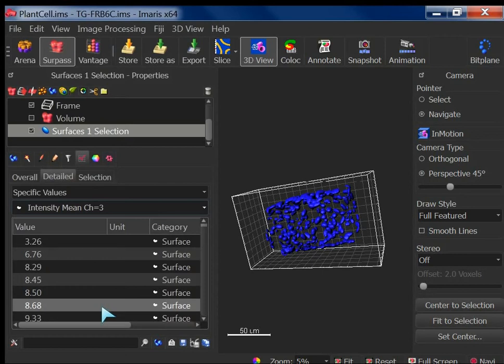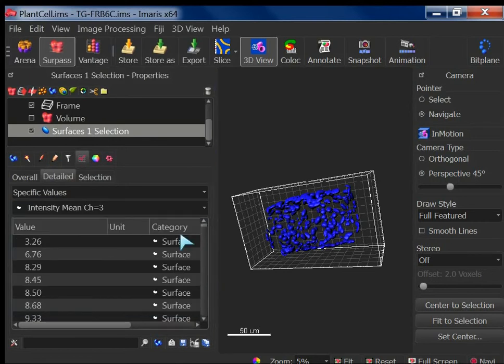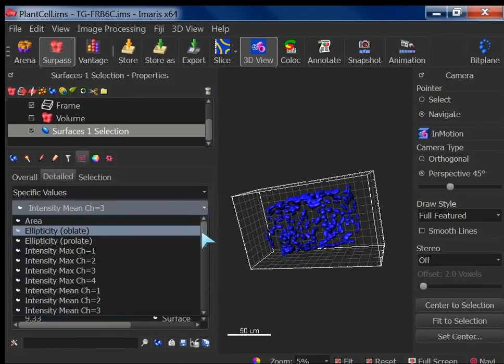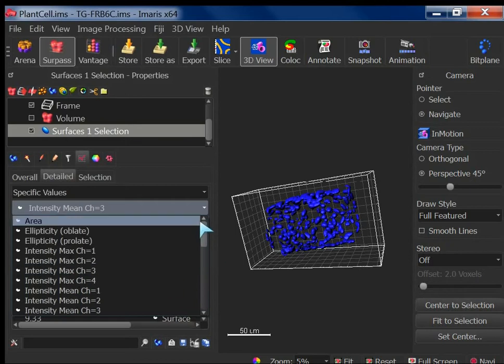Yeah, that's important, but it's not the same. But I mean, they could have just given you the option not based on the channel number, but the name instead. Okay. Yeah, thank you. But also be careful about what you select, the median or the minimum and the max. It's all statistics, right? And the center intensity.